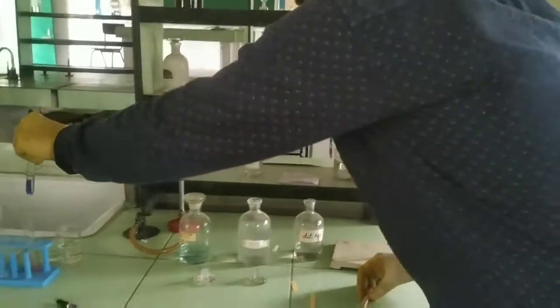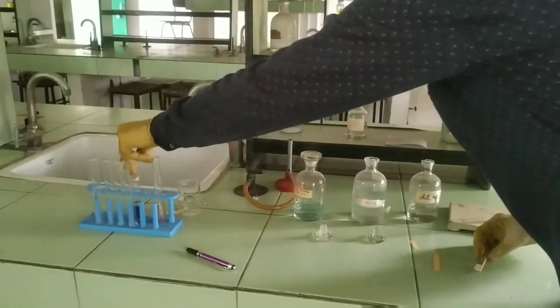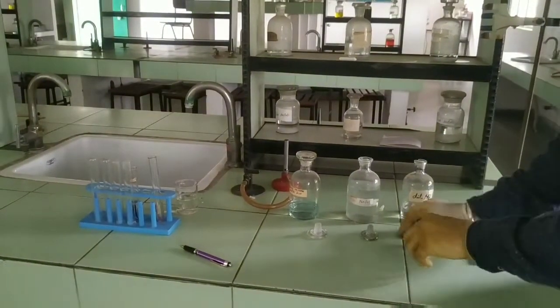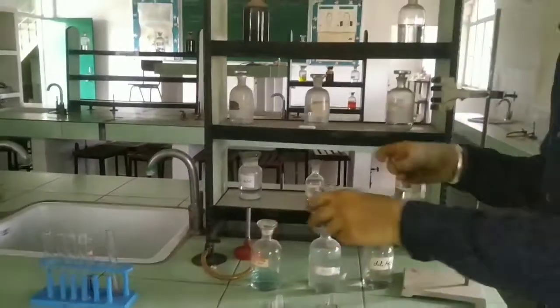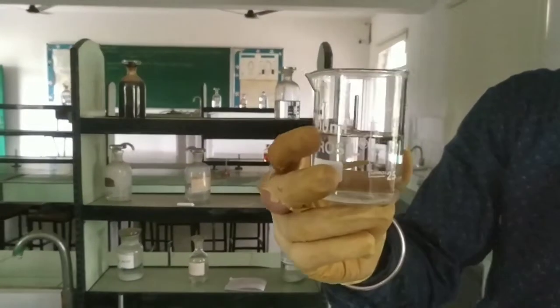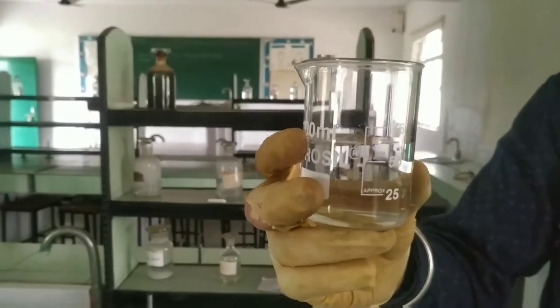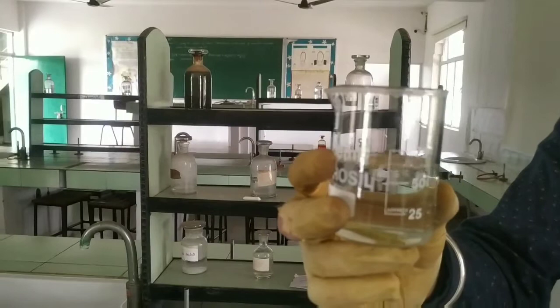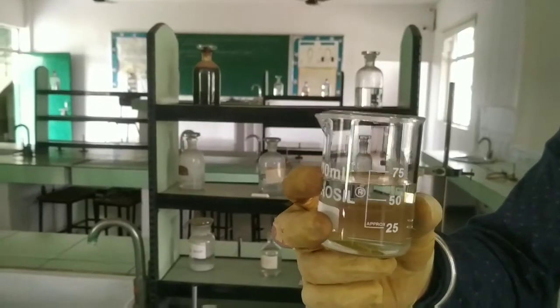Now we are going to do our experiment with water. So when we put litmus paper in the water, its color will remain the same. This proves the pH of water is neutral, meaning this is neither acidic nor basic.